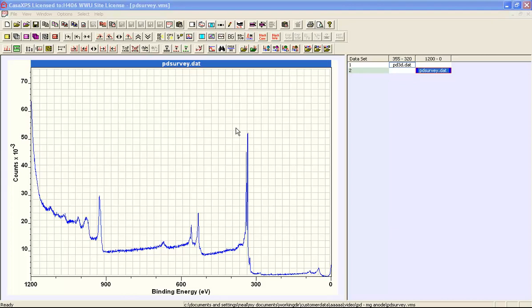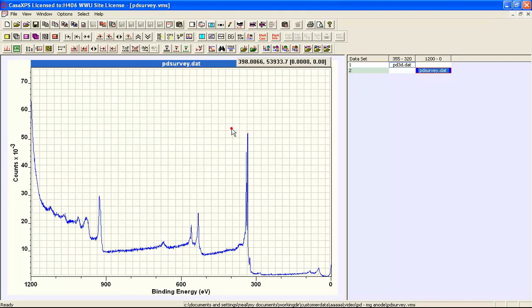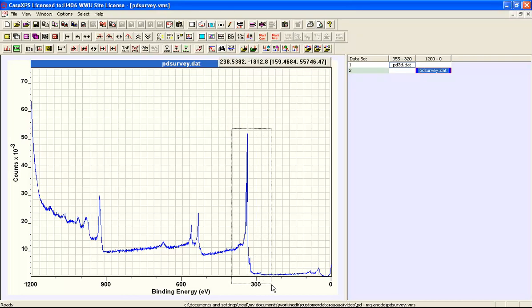But other than these two pieces of information, we have no information about the context for these data.